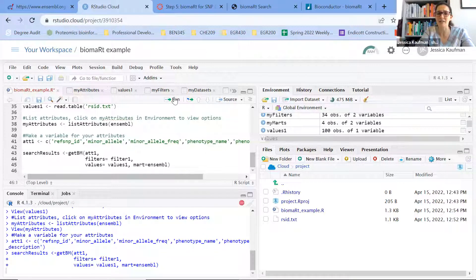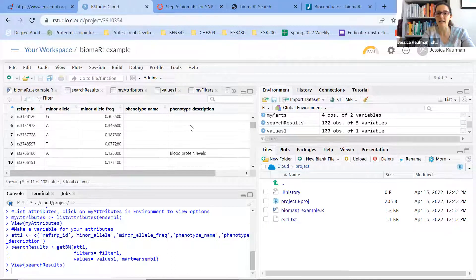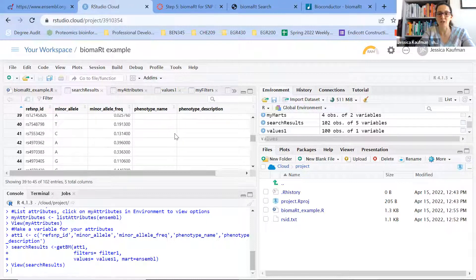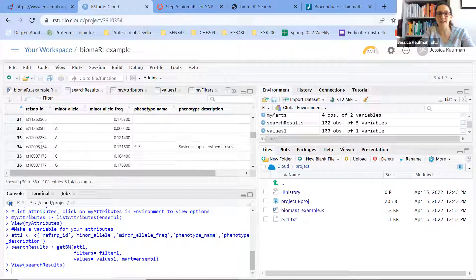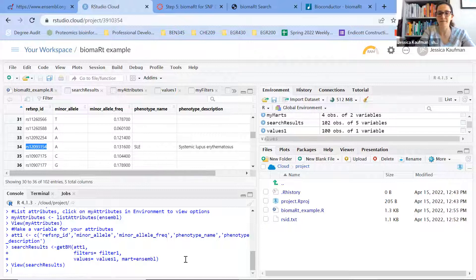It takes a little while to run the search, so the console won't return to the greater-than sign until it's done. Now when I click on the search results, each of the SNPs has a report: it has a minor allele, a minor allele frequency, and phenotype names and phenotype descriptions. For example, the SNP on line 34 is associated with a higher risk of lupus. That's how you set up your search when you're using Biomart through R. Let me know if you have any questions about this assignment or any of the steps in the Unit 4 project.